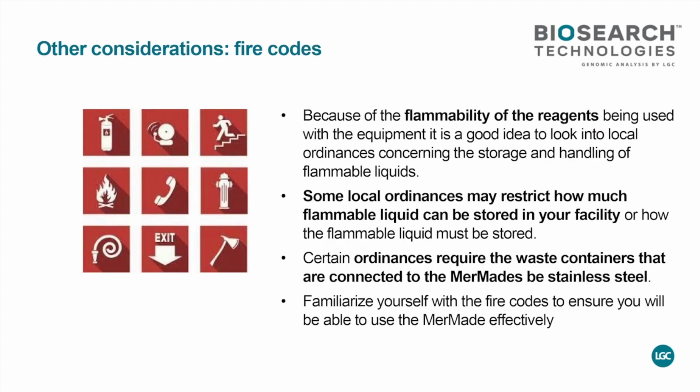So, fire codes. You will need to take into consideration the fire marshal requirements of your local state and your local city. Make sure that you have a proper amount of solvent allowance for where in the building you are located. In some situations, it's better to have the chemistry floor on the first floor because it has the highest allowance.